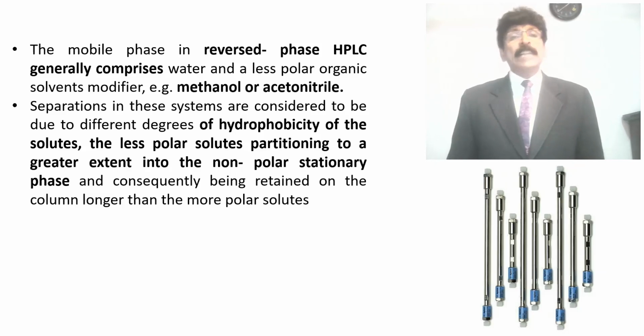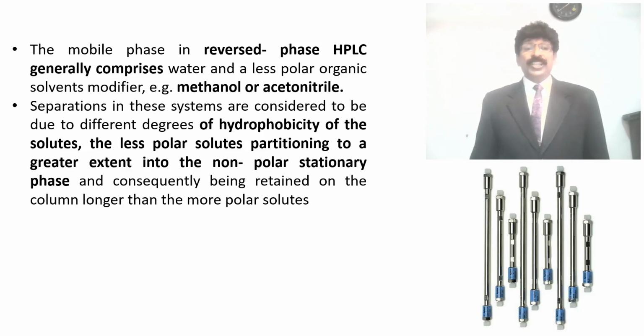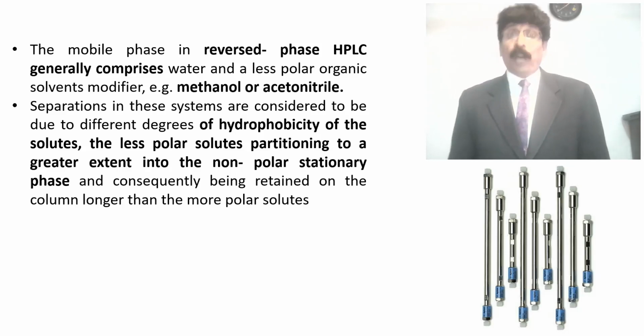The less polar solute partitions to a greater extent into the non-polar stationary phase, and consequently is retained on the column longer than more polar solutes.